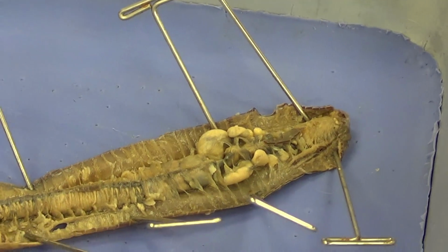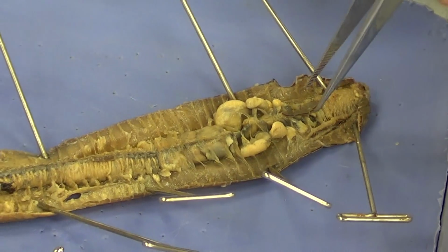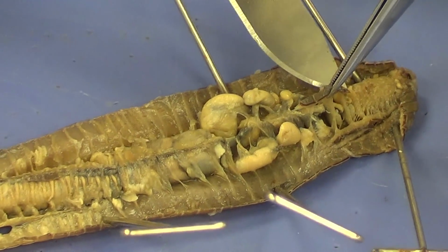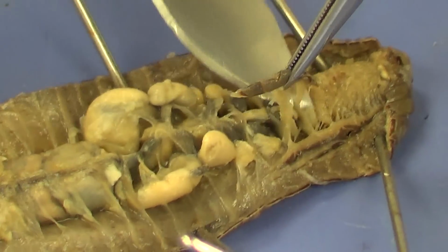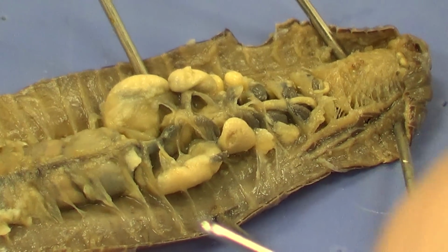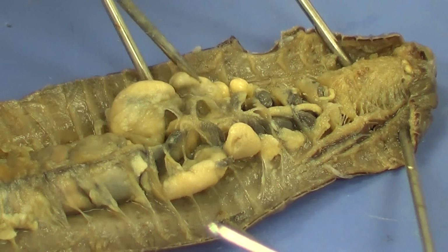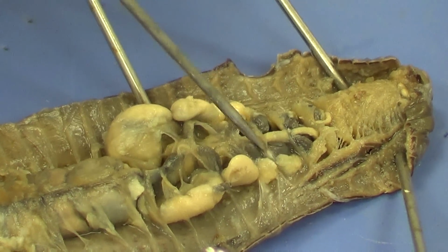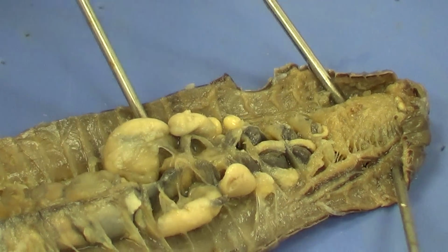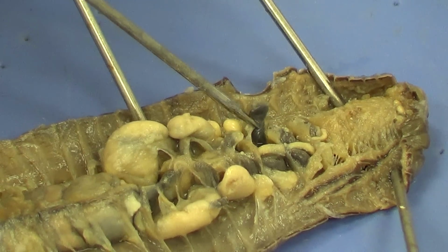Now, what we can do here, I see a little bit of skin still left on here. I'm going to pull it up just a little bit and cut that skin away very carefully. There's some good structures there, and we don't want to injure those structures. And what I'm looking for now, after I move the seminal vesicles and the seminal receptacles out of the way, is those aortic arches or hearts. And they're just going to be small black threads. Don't expect a lot. And you can see one right there.